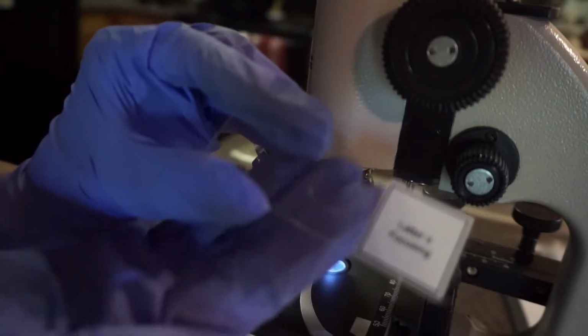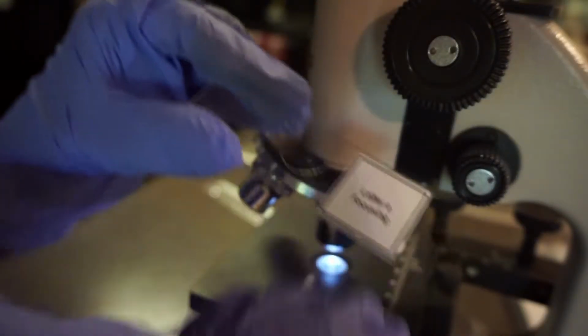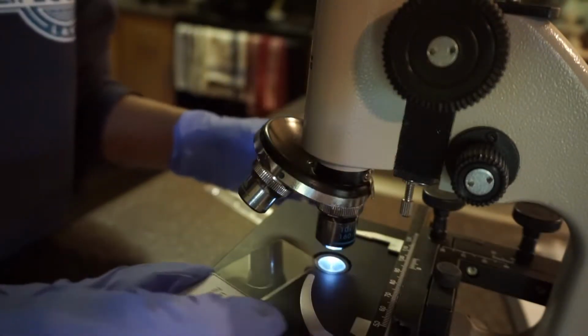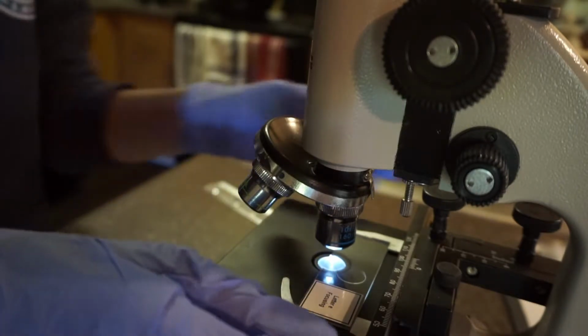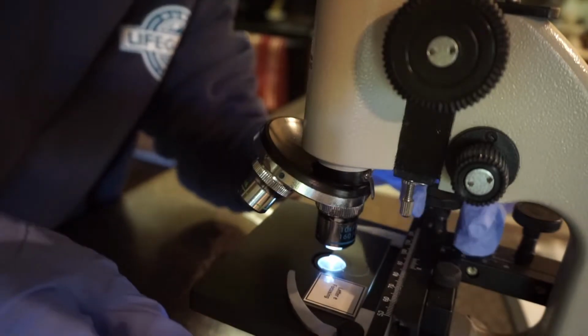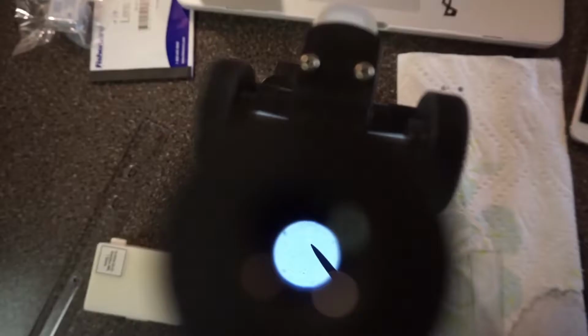Now I'm using this slide, which has a tiny little letter E right there in the middle, and I am going to use this to focus. So I just have to place this here and then center it right above the light source. This is the E slide under the scanning power lens. This is the letter E slide through the low power lens. This is the letter E slide under the high power lens.